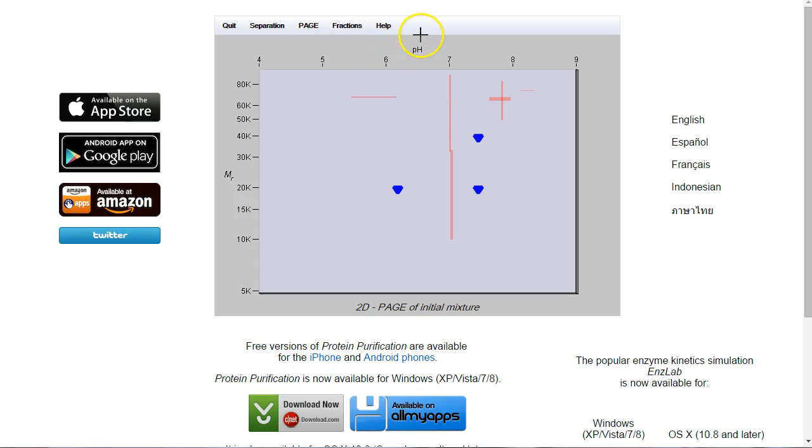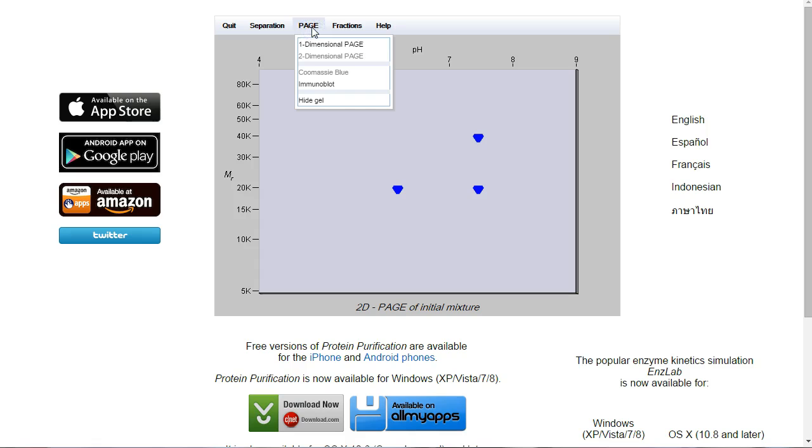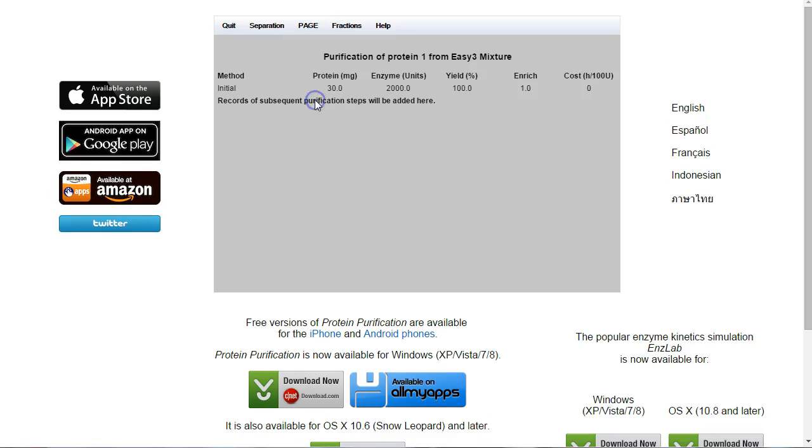The first thing we're going to do is use ion exchange chromatography. Ion exchange chromatography separates on the basis of charge. So I'll hide my gel, Page, Hide Gel.